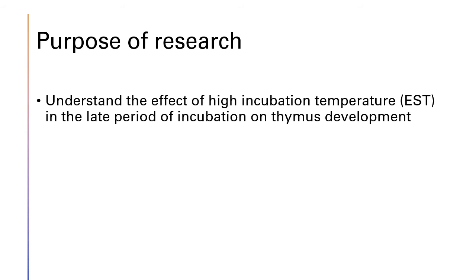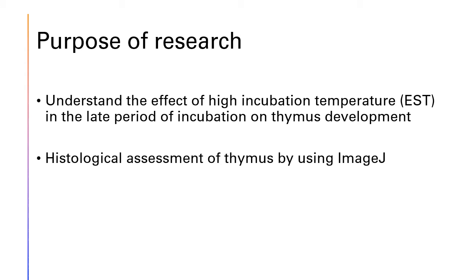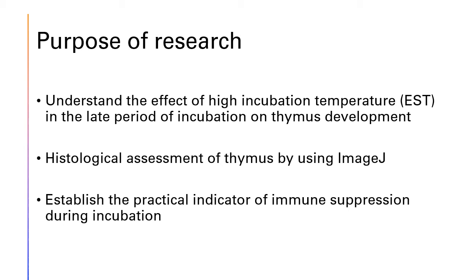The purpose of this study is to understand the effect of high incubation temperature in the late period of incubation on thymus development through histological assessment of the thymus using the ImageJ program. Therefore, a practical indicator of immune suppression during incubation can be established.